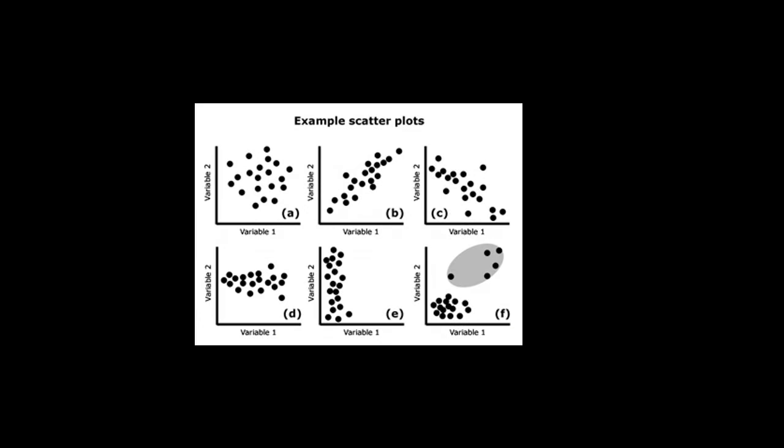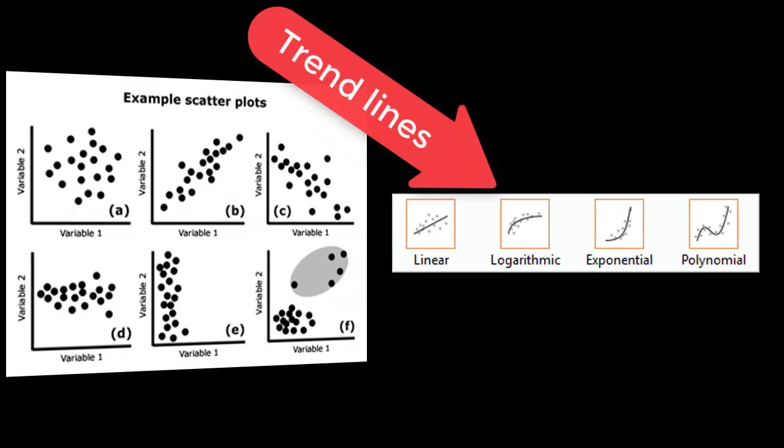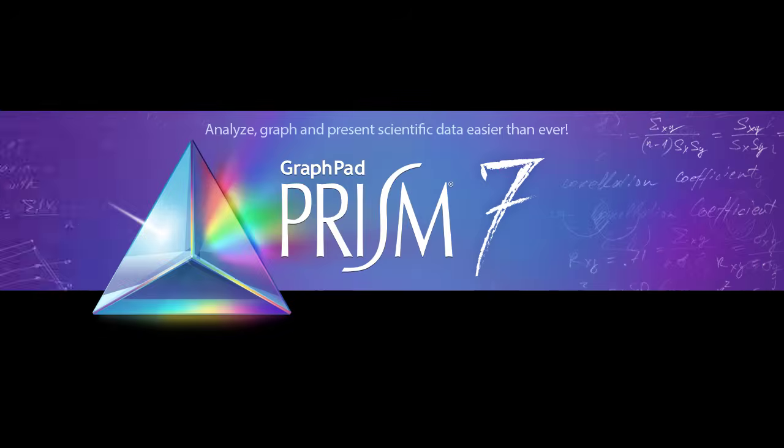The simplest way to display a correlation or relationship between two variables is to create a scatter plot. Using these data points, one can generate lines of best fit, or trend lines, that explain the trend. There are many kinds of trends. A trend can be increasing or decreasing. It can be linear, or exponential, or logarithmic, or sigmoidal, or polynomial, just to name a few. Of course, it can show if there's no trend at all, that is, there's no correlation between the variables.